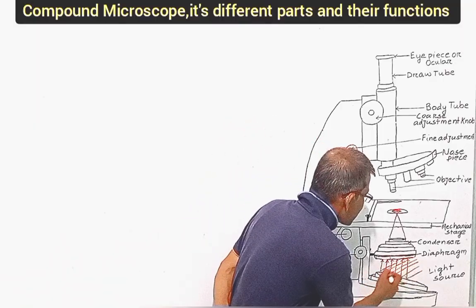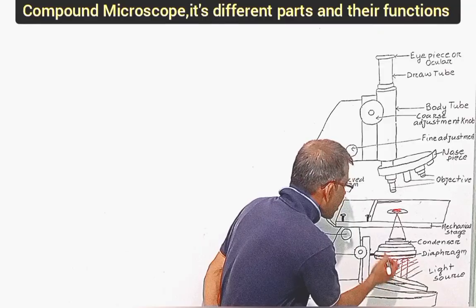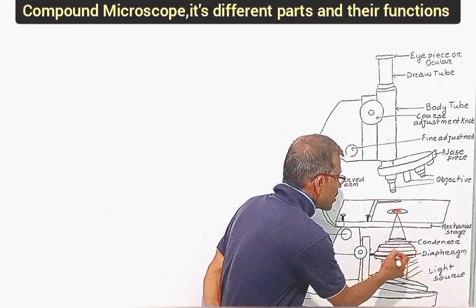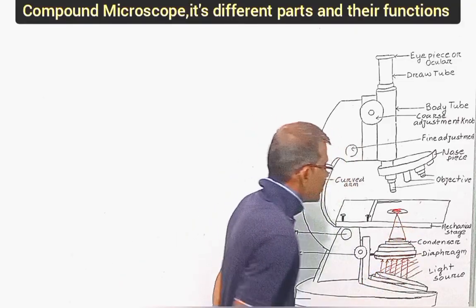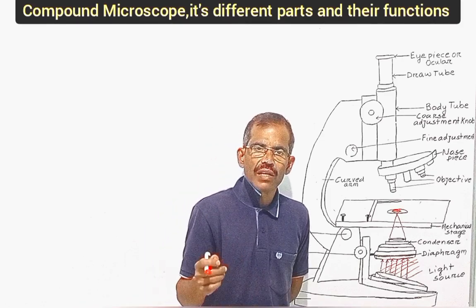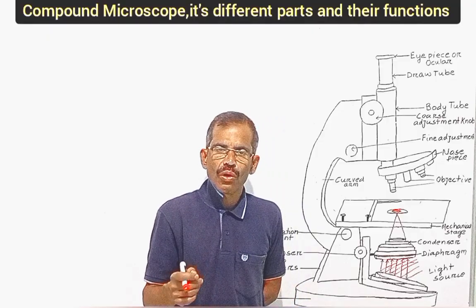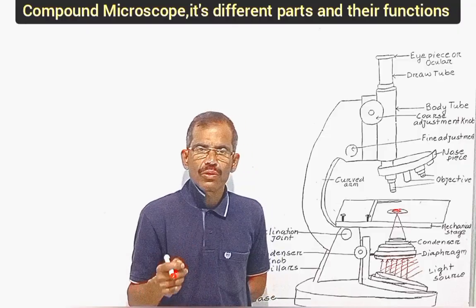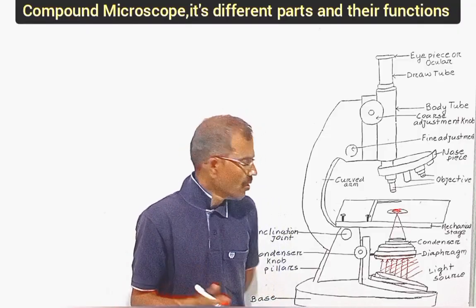When light falls on the mirror, it gets reflected, which is then allowed to pass through the condenser, which is positioned above. The condenser forms a cone of light. In modern microscopes, the source of light is inbuilt at the base. It can be a halogen or LED lamp. Whereas in the case of a fluorescence microscope, an arc lamp is used for illumination.